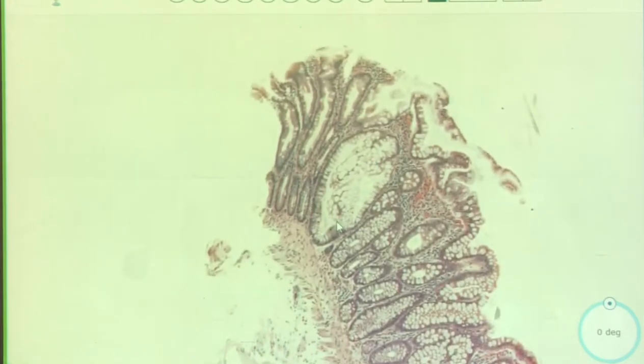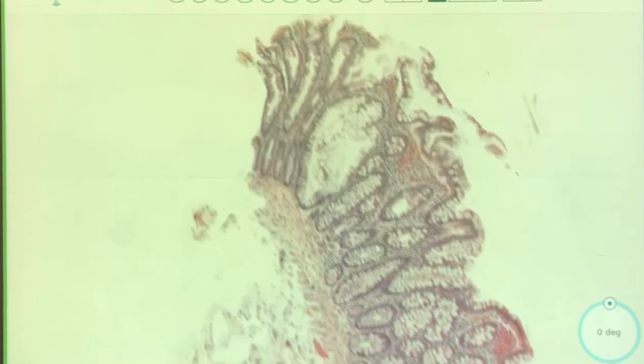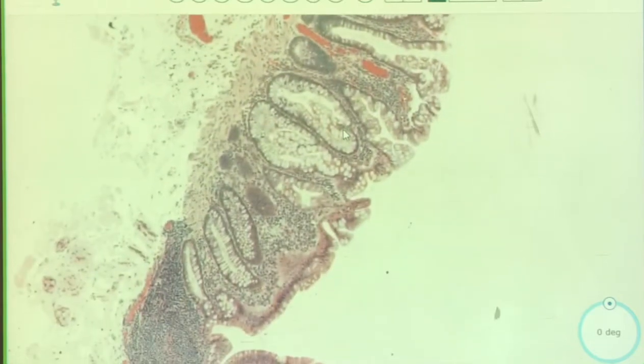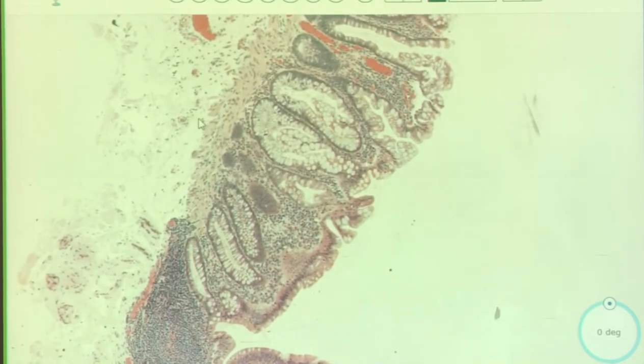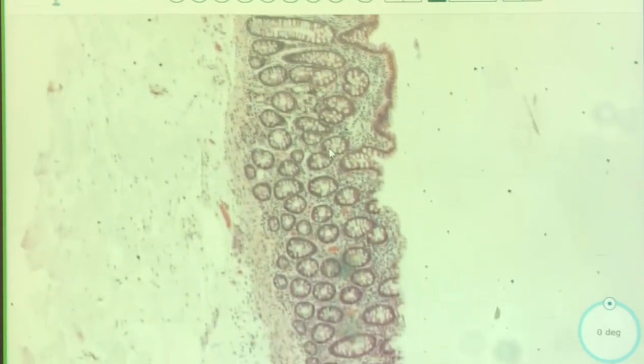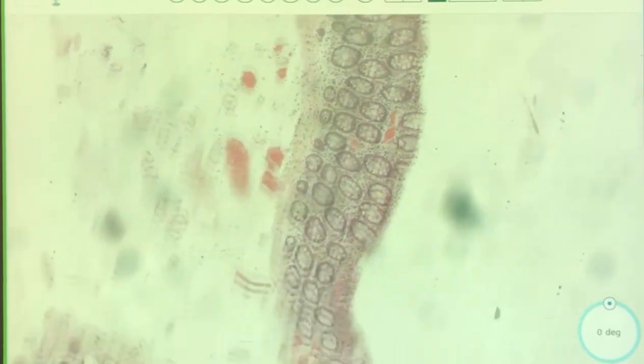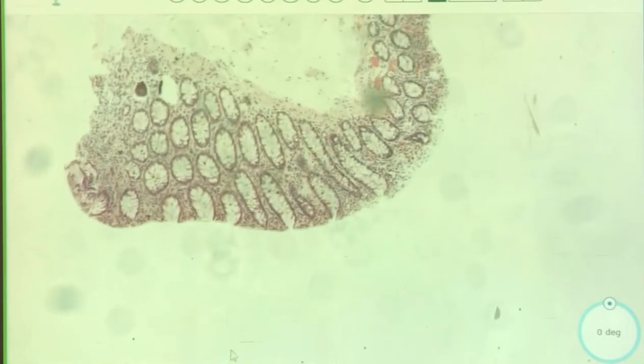Let's look at the other piece. Look at that one. You see how that one's super dilated, but you look at the base and it's not. So you have to be careful with that, because there are other polyps that just have dilation. Those ones are better. That's why they say like the Italian boot, where it's super skinny up top and then it gets wide at the bottom because you have the heel and the toe of the boot.